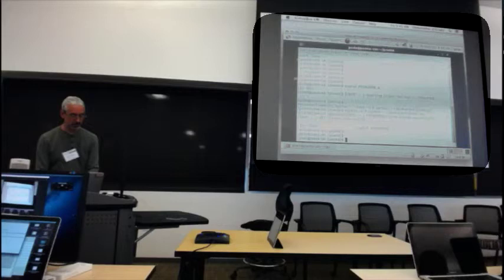right down here. And then this is our usual stuff. This is the experiment we're analyzing. This is the run. This says that we're doing it with the random access mode. This is that ugly line that you saw before, which is the name of the detector, which we're actively working on trying to simplify, because that's not a fun line to type. Publish is we're publishing the real-time plots. So this is initializing the real-time plotting. And then we're going down the file here.